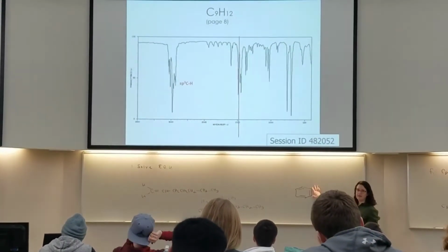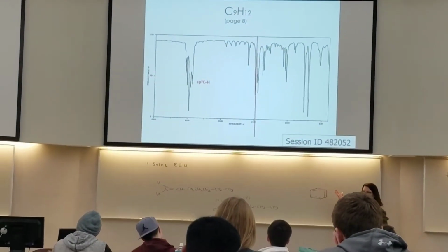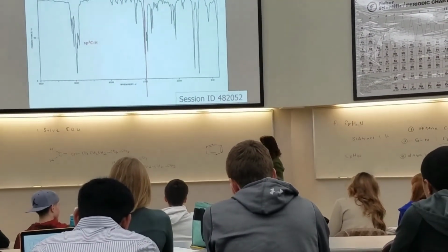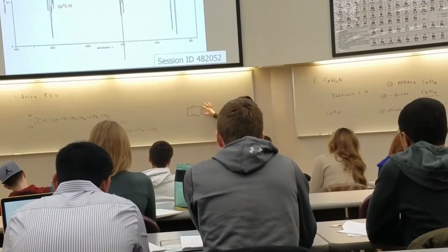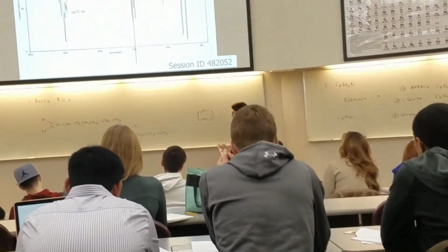But the double bonds, those are the peaks that we want to look for. And there's 3 double bonds, but we're just going to see one peak for that in the spectra. So all double bonds just show up as the one peak. And then this ring, there's no peak for the ring. So the functional group part of it is this double bond part of the structure, right?